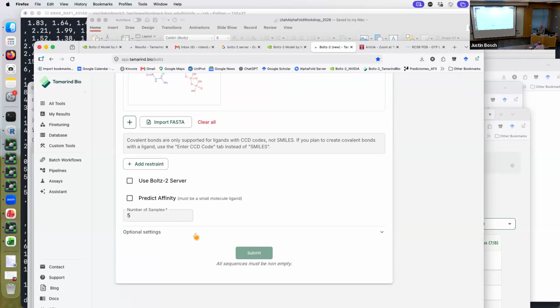So you could put in any drug you want. If it's a drug that is not in the PDB, you can probably go to PubChem. It might be a site where lots of molecules are in there that are not in the PDB. You can search for your molecule by name, by structure on that website and get a SMILES string. If it's a molecule that's never been made before, I have no idea how you get a SMILES string. Organic chemists probably would help you do that. I'm sure there's ways you could Google them. I don't know how to do it.